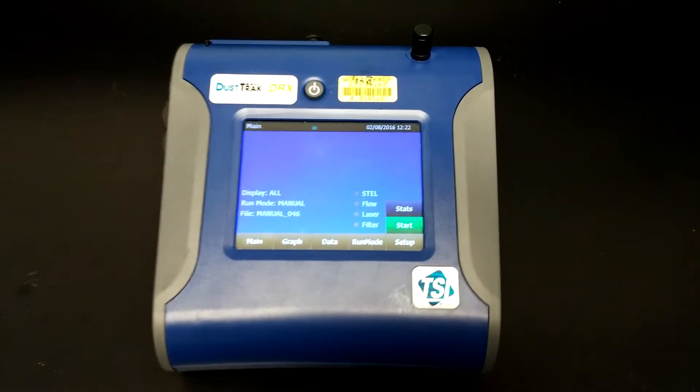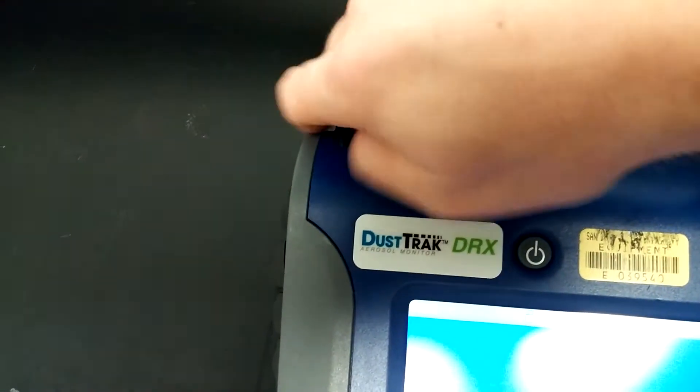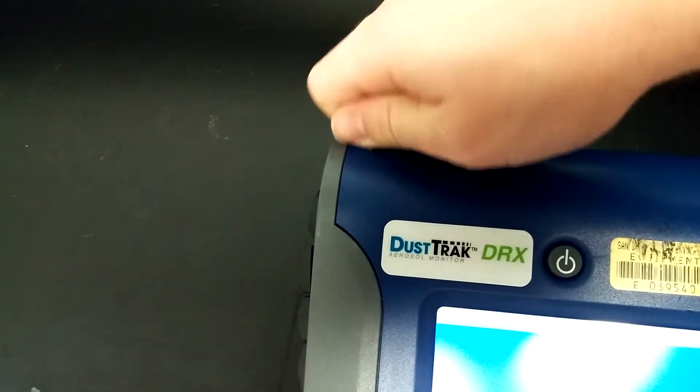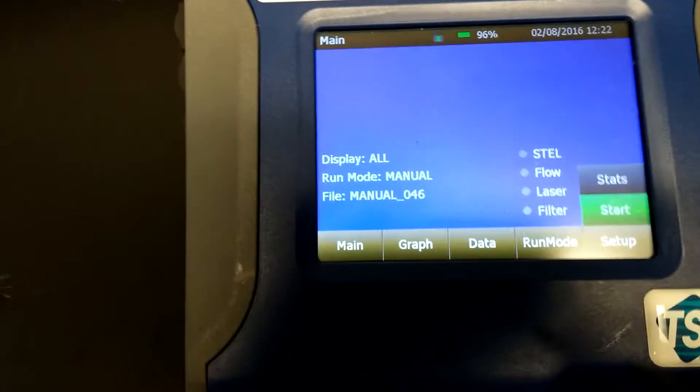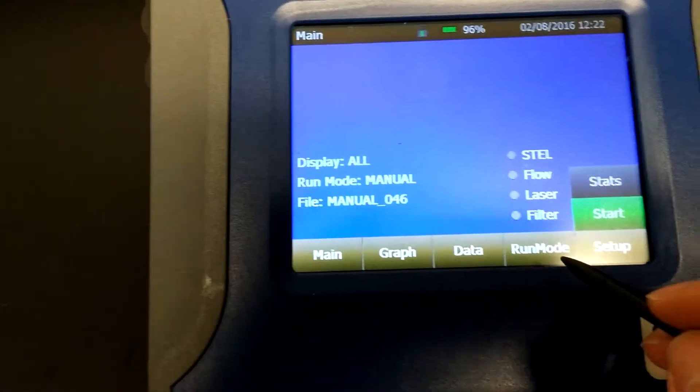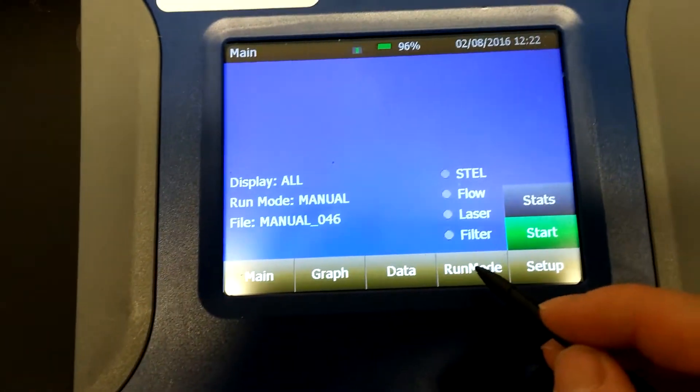Once the Dust Track DRX is powered on, grab the stylus at the top left and go to run mode.